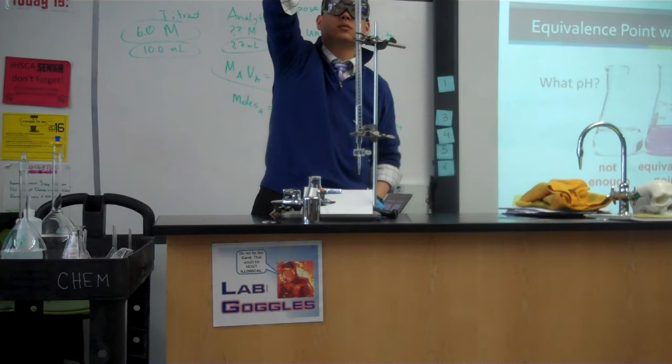This is not acid. This is sodium hydroxide. This is our base. Alright, I'm only going to fill up to about 20, and we'll record from there.